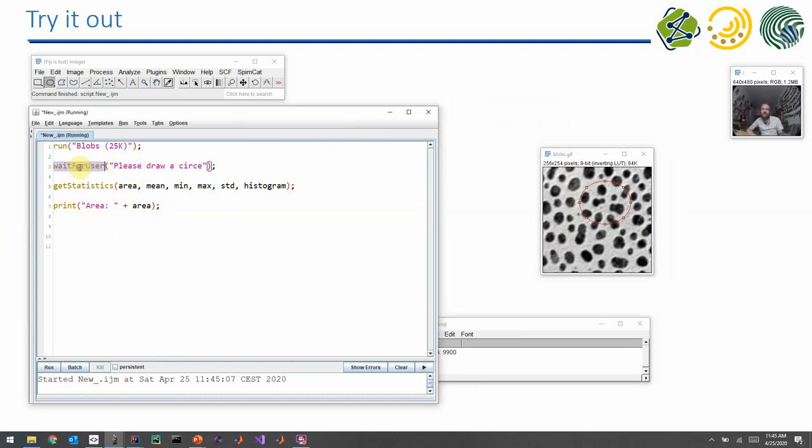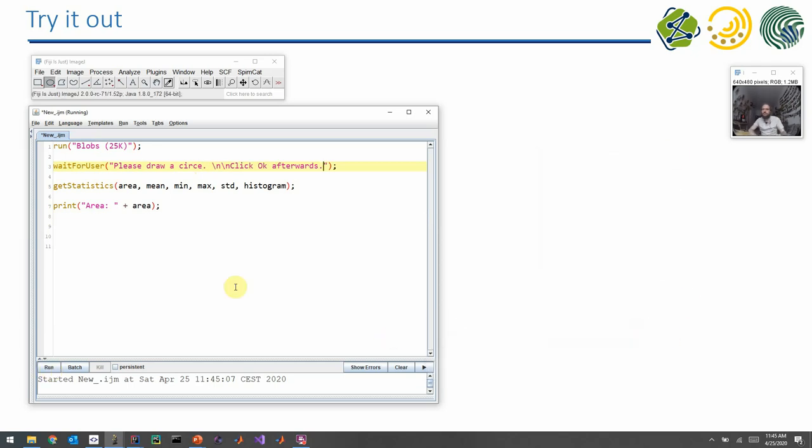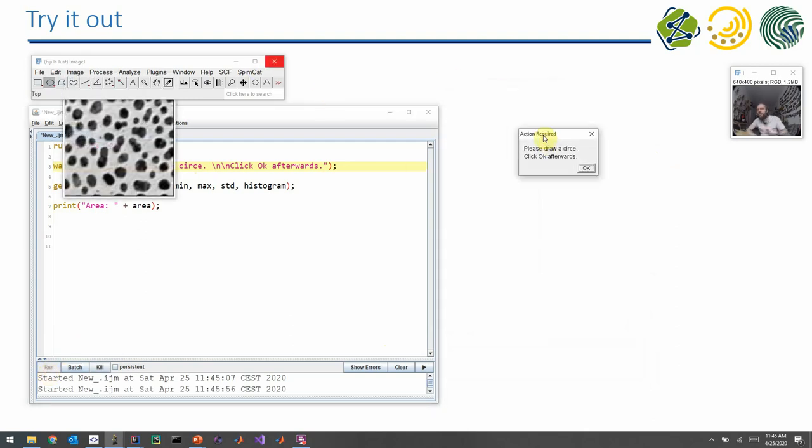So in this waitForUser method, it's from a user convenience point of view, it's kind of important to always write this little sentence. It's a line break, by the way.